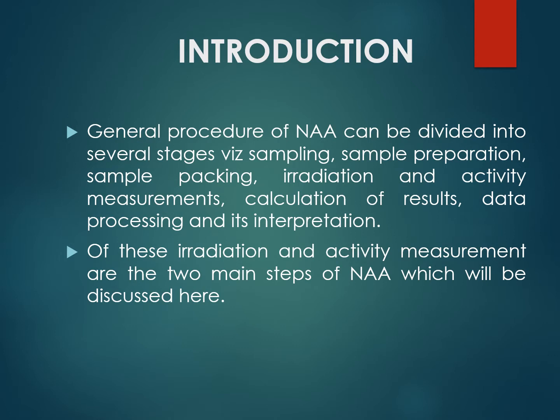Out of that laboratory sample that we are using in the lab, the very small amount of sample on which we are only doing some analysis is known as the aliquot. So this whole four-step procedure is known as the sample preparation procedure.